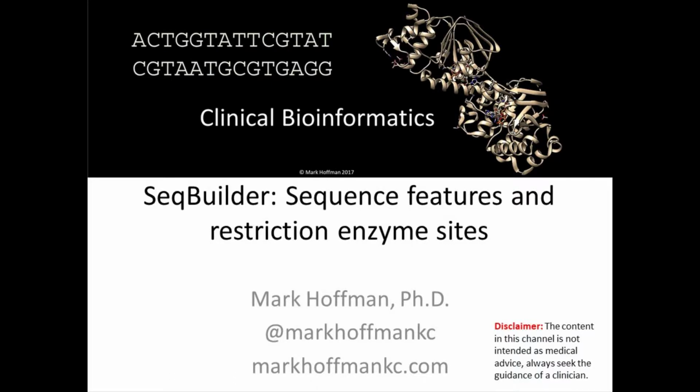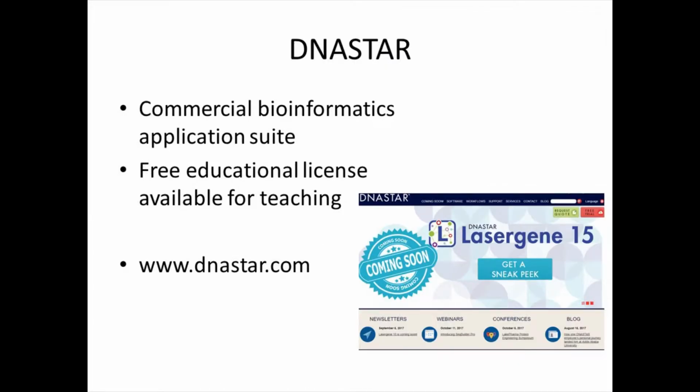In this session, we'll learn how to use a program called SeqBuilder to evaluate DNA sequence features and identify restriction enzyme sites. We will be using a commercial bioinformatics application suite by DNASTAR. They have provided a free educational license available for teaching purposes.